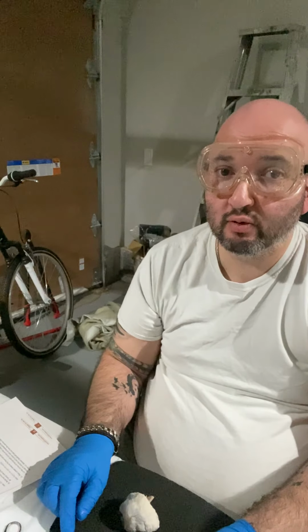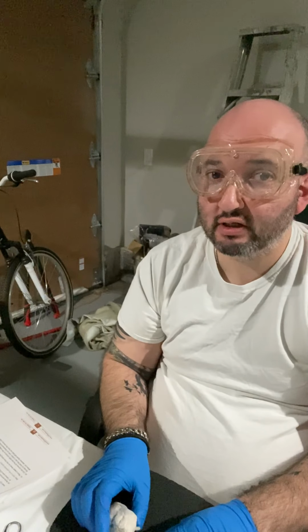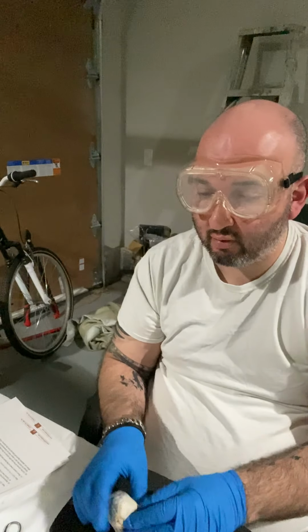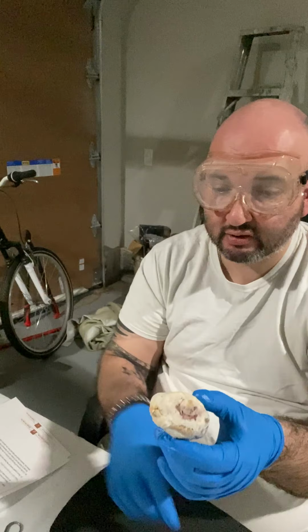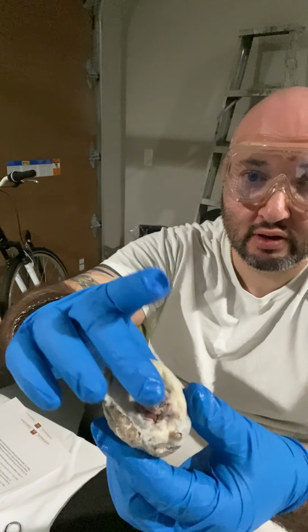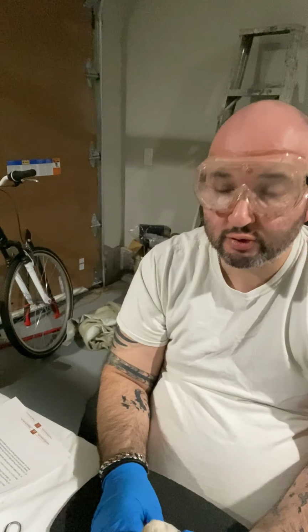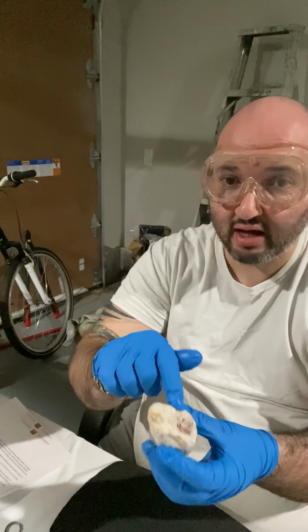In this week's video, I will be dissecting a cow eye, which I have here, and I will be discussing the components or the parts of the cow eye. Before I go any further, I did want to point out a couple of bits here. This bit protruding right there is the optic nerve. It's obviously a nerve. Its job is to transmit impulses to the brain from the retina that's at the back of the eye.